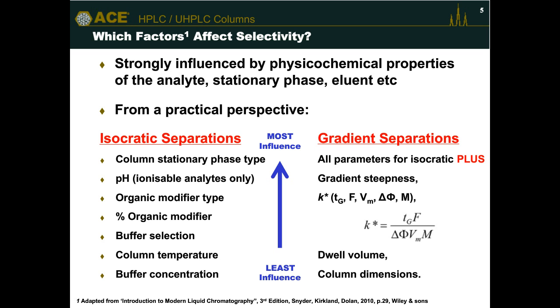Now, the important thing to think about is from a method development perspective, which parameters should we focus on? Because there are lots of different ways to do method development, and many analysts and chromatographers like to change certain parameters as part of their approach to their method development.